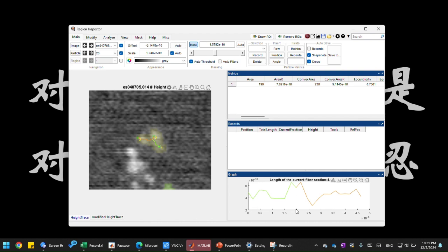The middle is where the color intersects here at point 2. And the color matches the trace on the image as well, and ends in 3. The 3 endpoint is on the right side. So now you have at least a peak in the middle, right? So that's how you trace this protein properly.